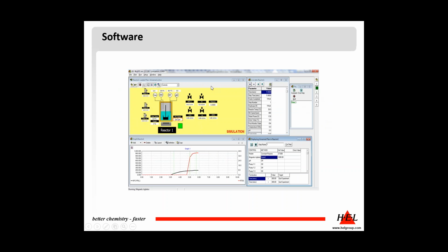Before I get onto gas mixing, I just want to cover the software that we offer with the system. The first part of the system you should look at is the Mimic screen, and here the Mimic represents all the hardware you have on your bench, so the reactor itself, the probes, the liquid feeds and the gas management system. Then we have a reactor selector. Here this is an example of a 4-reactor selector, so we have four buttons to click here for each reactor. We do have a 5th button, and that is actually the gas manager, which I'll come to next.